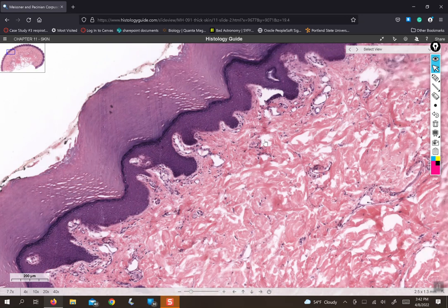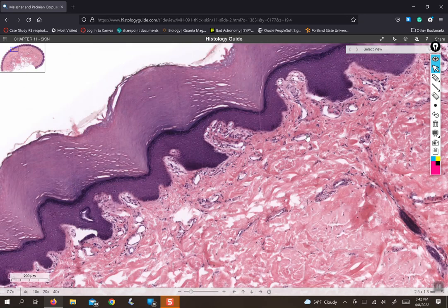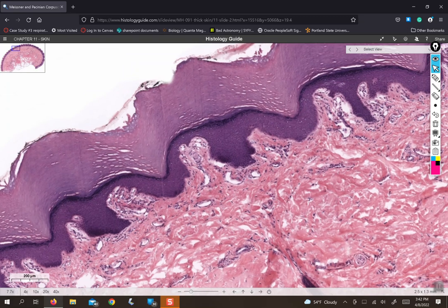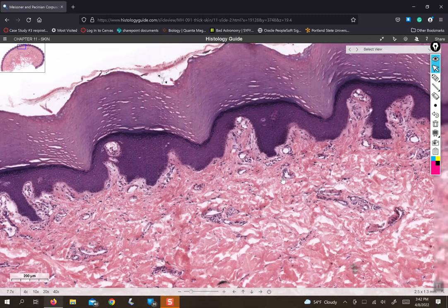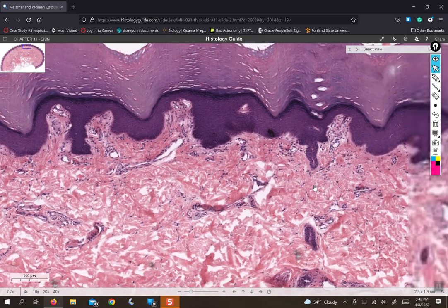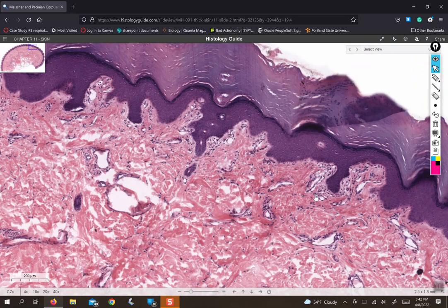This is one, but it's probably not one I would pick for a test because it's not especially conspicuous. I like it when they look really thumbprinty and are very large and obvious, like this one is. That's a good one. And let's keep looking. None of these have any. Here's one. Again, not a great one, but it is one, so I'll show it to you.